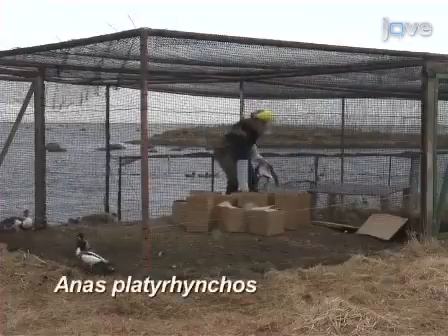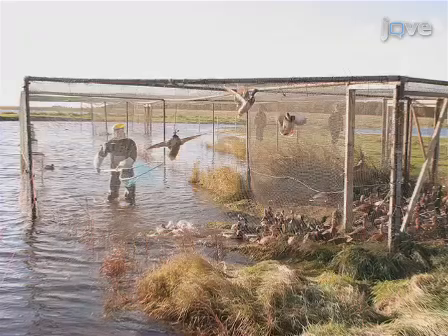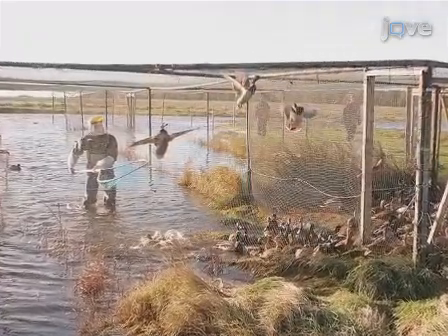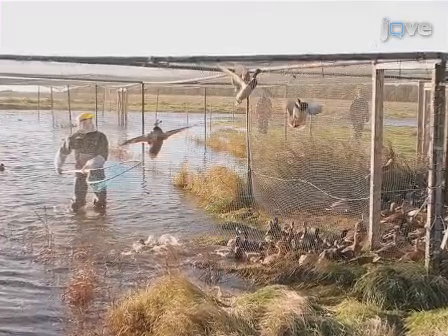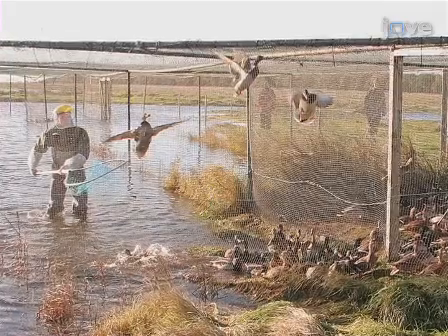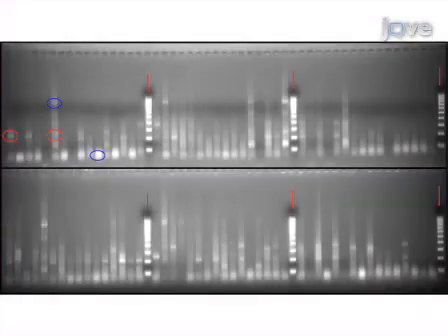84 mallards were sampled at Ottenby Bird Observatory in December 2007. From each mallard, a sample on an FTA card was taken as described in this protocol. After shipping, the FTA cards were kept in a freezer at -20°C for 2 years. A gel picture of the PCR products from these 84 samples is shown here.